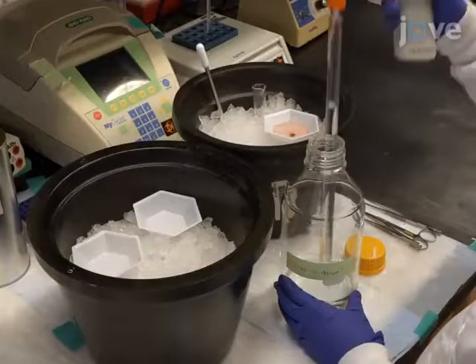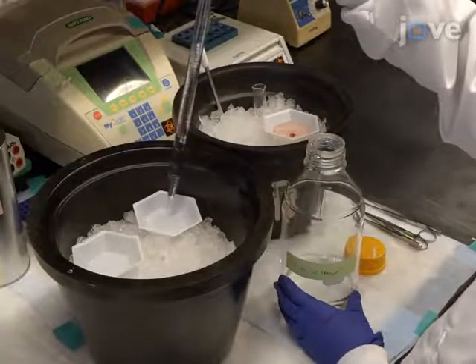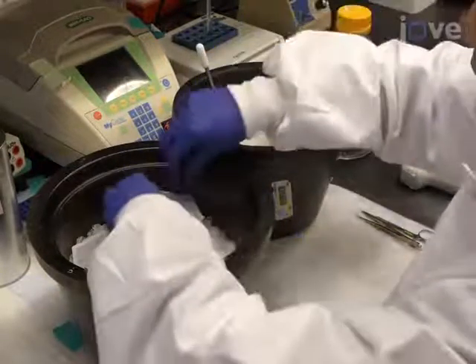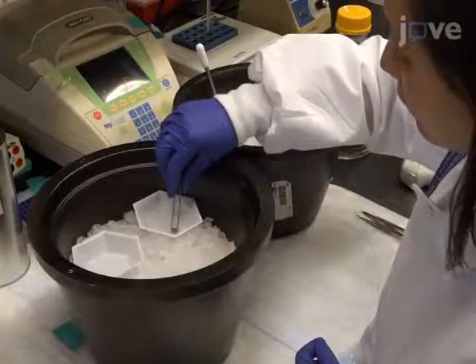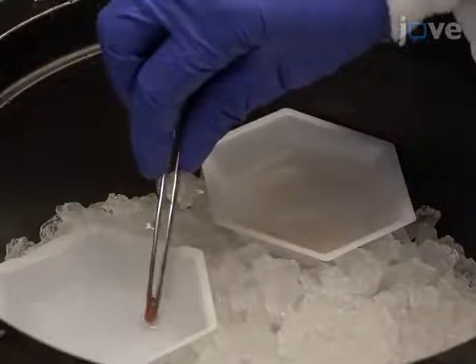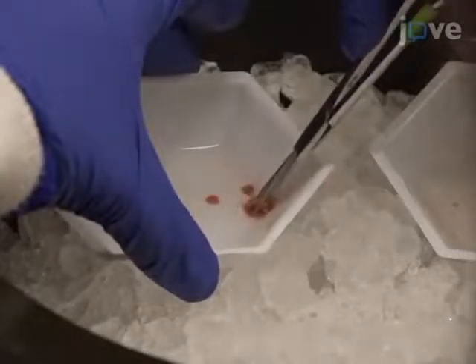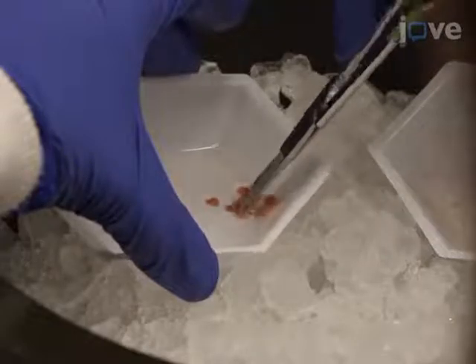Start this experiment by thoroughly rinsing the previously isolated heart in 25 mL of ice-cold 1X PBS, making sure that the blood is completely squeezed out of the ventricles. In 5 mL of ice-cold 1X PBS, using a pair of sharp scissors, mince the heart tissue into small pieces.